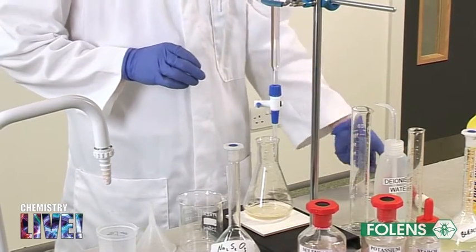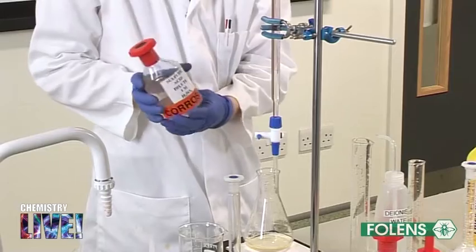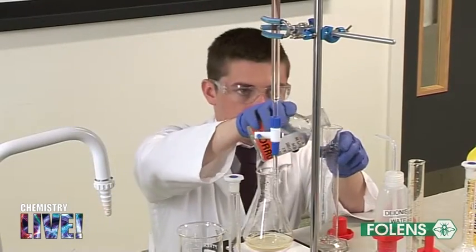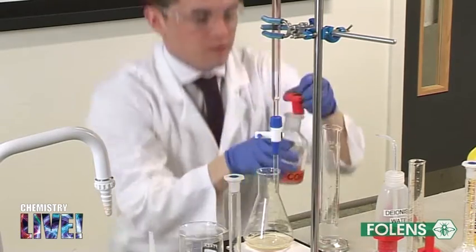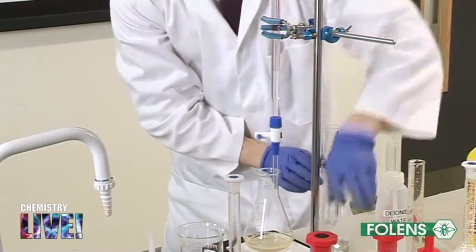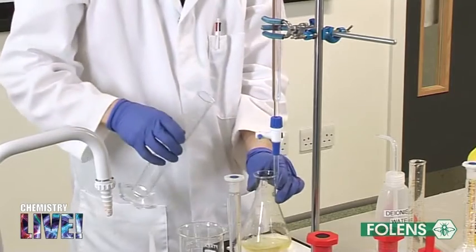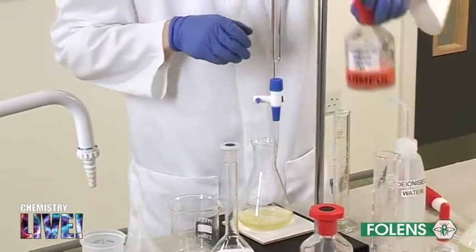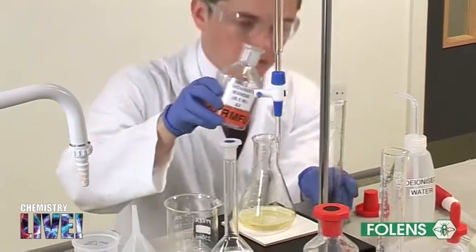Using a graduated cylinder, add 20 cm³ approximately of diluted sulfuric acid, followed by 10 cm³ of 0.5 molar potassium iodide solution to the conical flask.